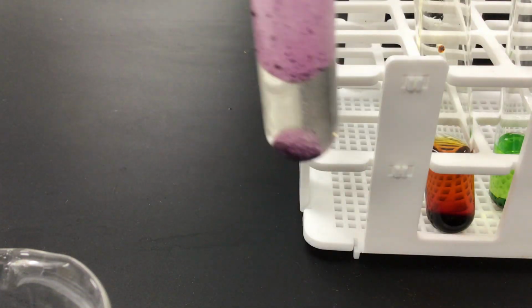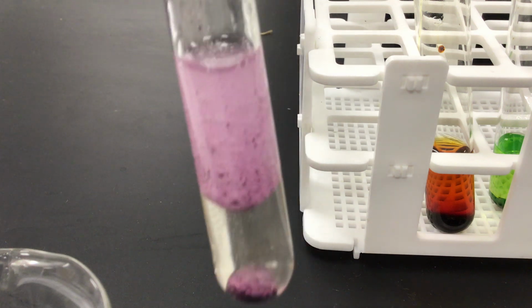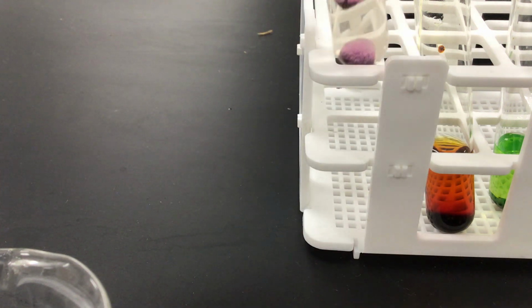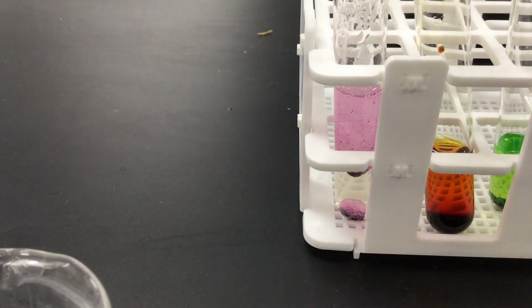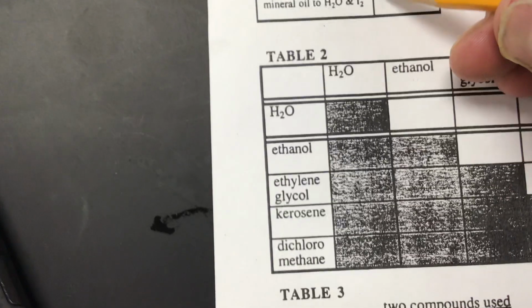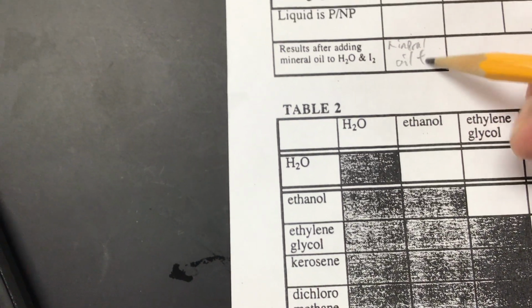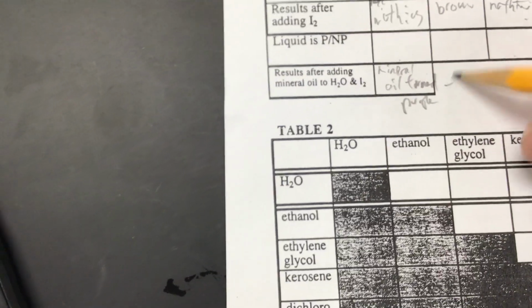And what we get is the mineral oil layer turned purple. So in other words, the iodine mixed with the mineral oil. We had 2 layers of water and mineral oil.